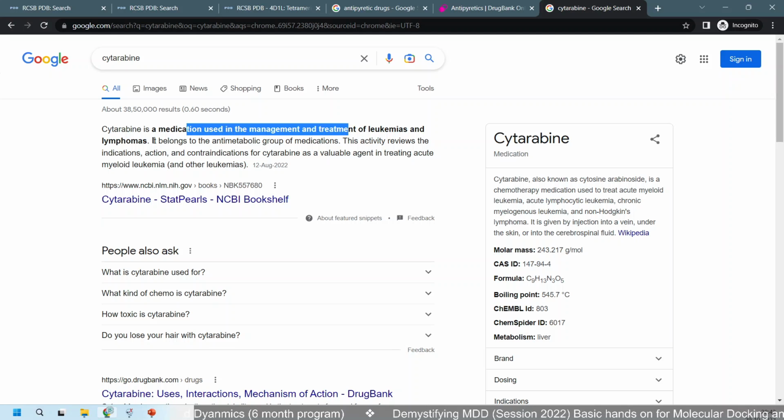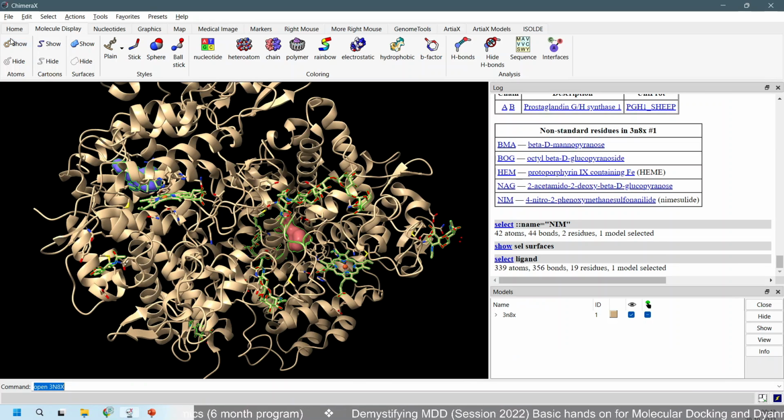I think action, sir. From action, you have to go to surface, then show. If you see Chimera X here, you are seeing atoms, cartoons, and surfaces. These names should be present in your drop down or older versions. Like that you can find something similar in your package of software. Any other software will have similar options.